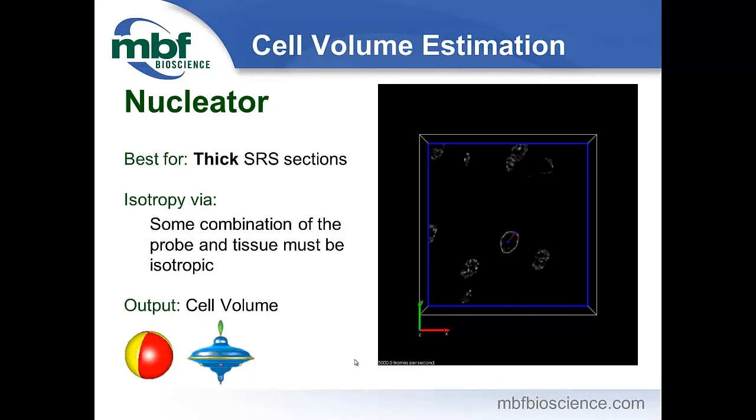Then when you do the nucleator, it matters how the cells were cut. Therefore, you need to do this thing with the beach ball where your block of tissue is random in 3 planes, or do a vertical section where it is random in 2 planes. And if you use vertical sections, you're going to have to show the software what the vertical direction is, because it's going to sine weight the line and make up for the fact that one of the directions is not random.